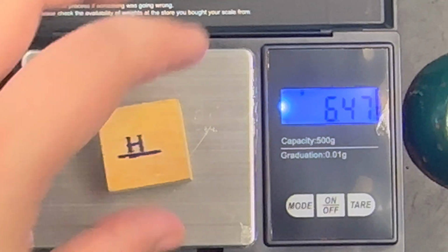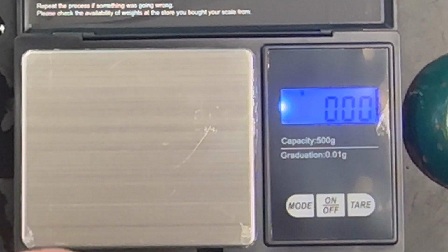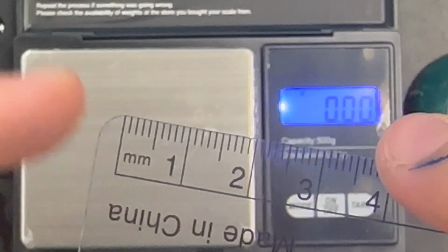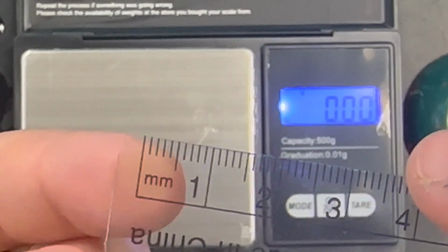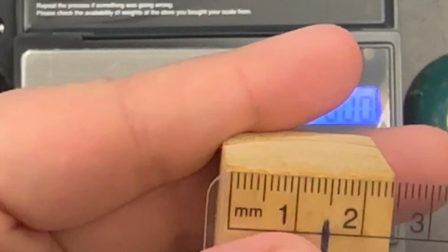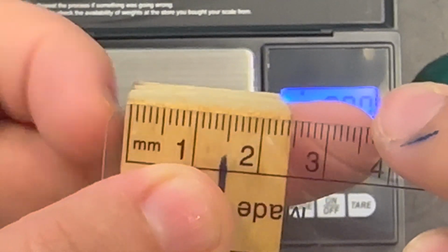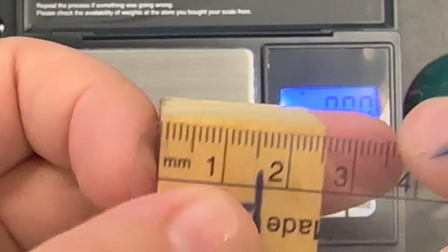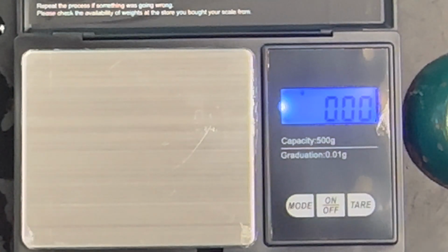Then we're going to measure the length. So these are cubes. Length times width times height is the volume, and all of the sides are the same. So if you look at it, again, we want to look at our ruler carefully, not at the end, but where the measurement starts is where we're going to put this. So this is 2.5, oops, move it over a little bit, 2.5 centimeters. So it means each side is 2.5 centimeters. We'll record that. And to calculate the volume, it would be 2.5 times 2.5 times 2.5.